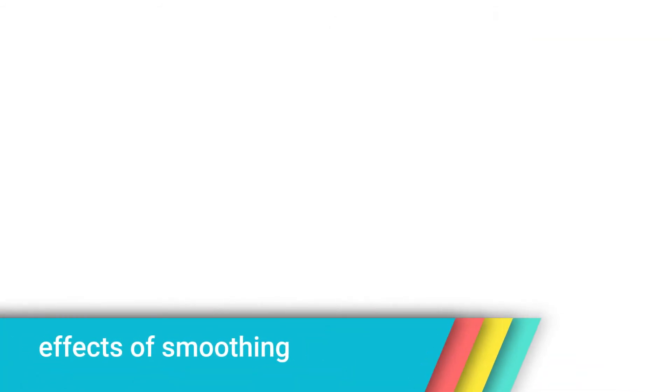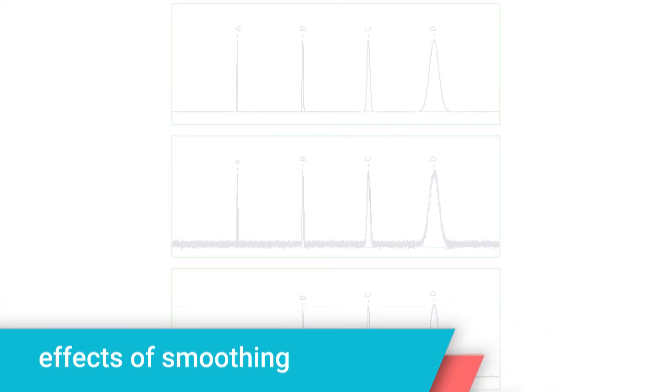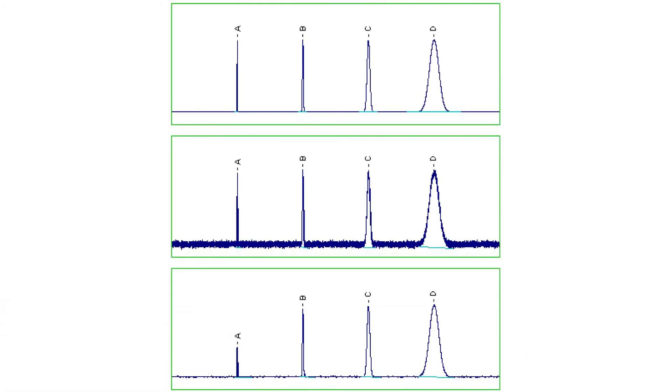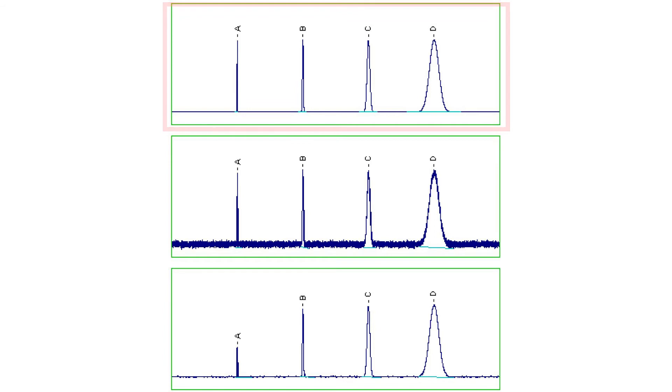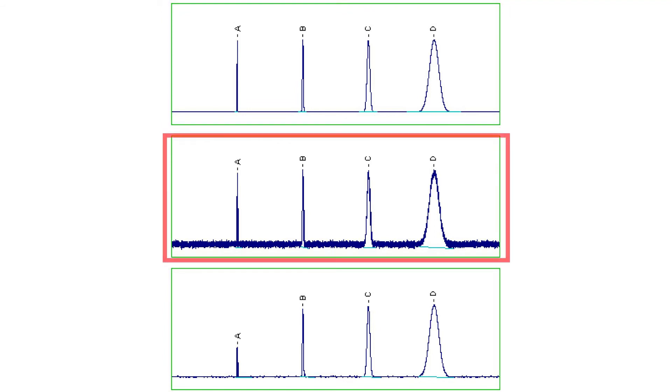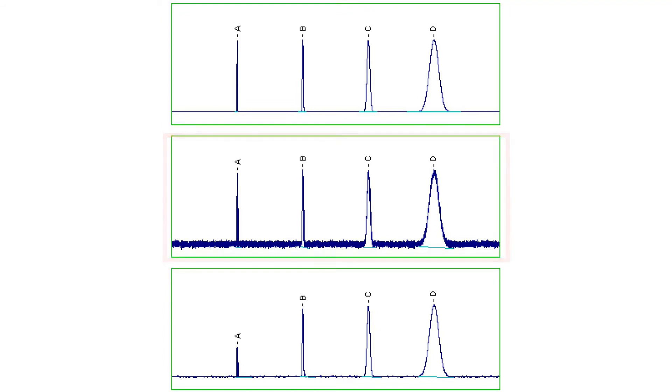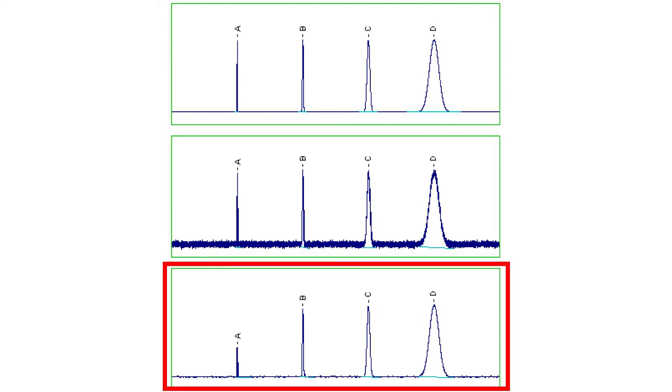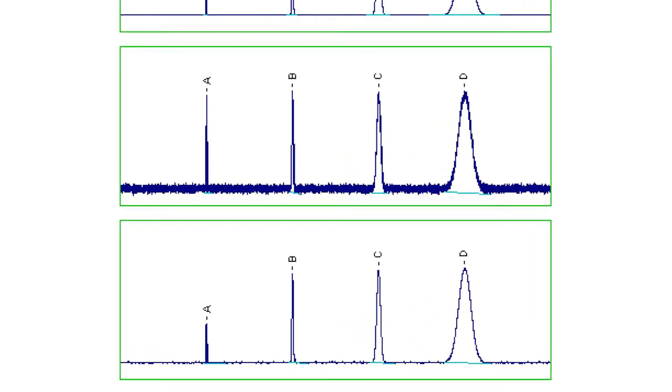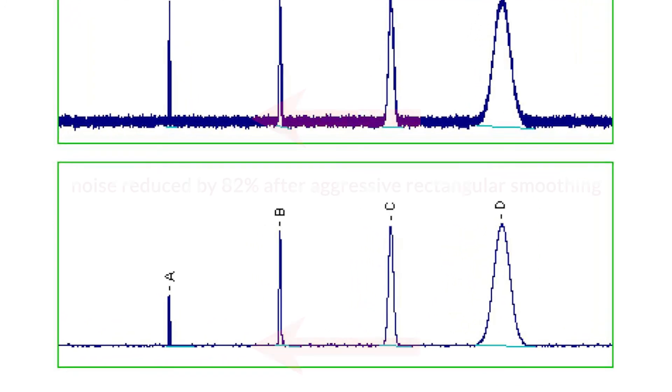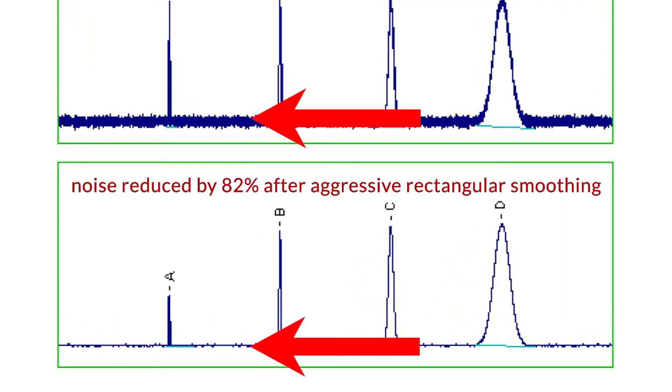Effects of smoothing. The upper trace of the plots shown on screen shows a noise-free chromatogram. The middle trace is the same chromatogram with added noise. The third trace shows the noisy chromatogram after rectangular smoothing with a smoothing time value of 1.5 seconds. This value is abnormally large but was chosen for demonstration purposes. Noise measurements reveal that smoothing has reduced the noise by 82%.